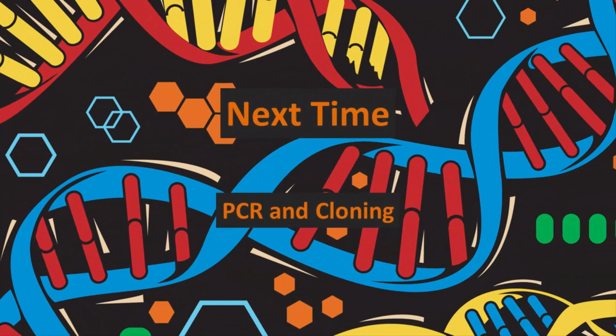Those are the bioinformatics tools we will be using in lab. Next week, you'll be selecting a gene you're interested in and using these tools to start to learn more about it, and maybe begin to develop a hypothesis regarding its function. Then it will be time to start cloning that gene.